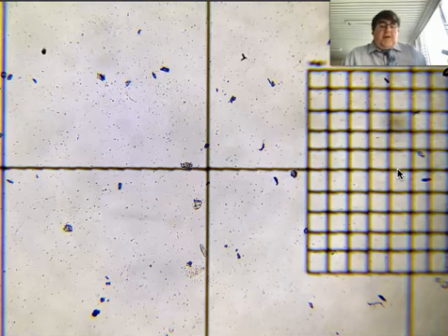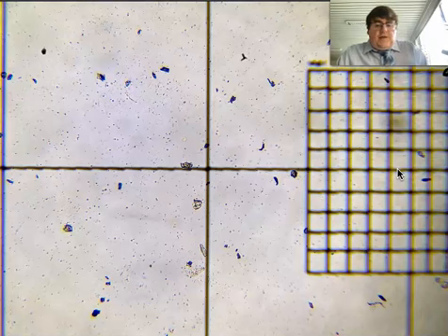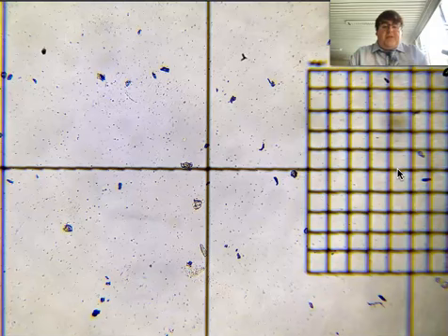So over here, the whole field of view for this 4 times magnification objective lens is going to be 2.2 millimeters long. So anything that I look at in here, if it took up the whole slide, is going to be 2.2 millimeters, and that helps set that scale.